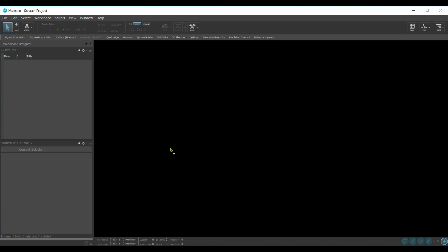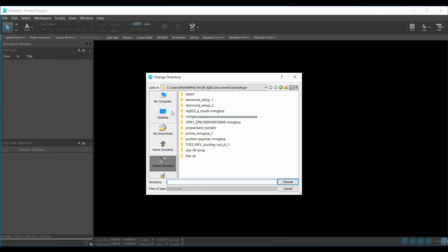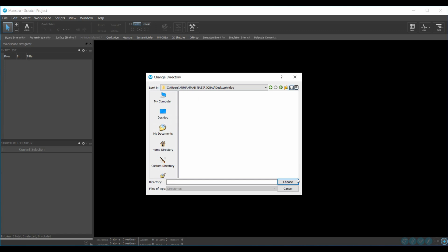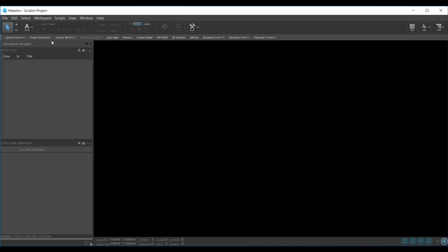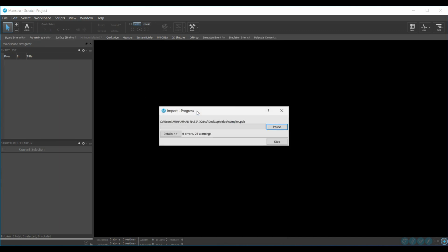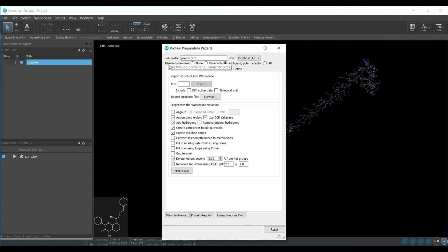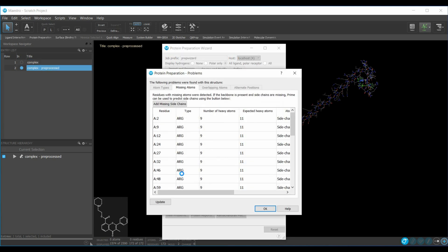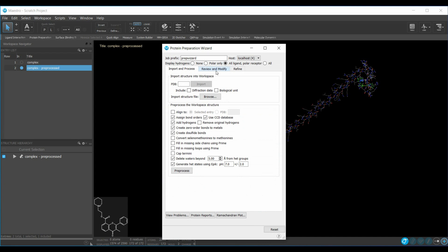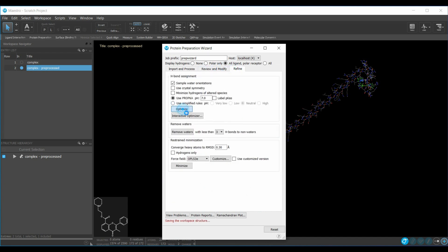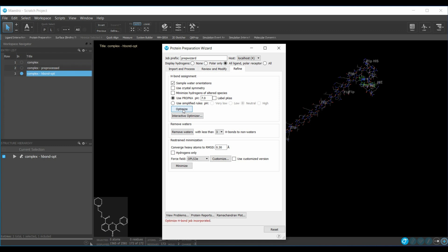This is the Maestro interface. First select the directory and change the working directory to the folder containing your complex. Go to the Protein Preparation Wizard, browse for the complex, click OK, and ignore any warnings. Pre-process with default settings, then go to Refine and optimize and minimize the complex. Once optimized hydrogen bonds are incorporated, select the force field OPLS 2005 and click Minimize.